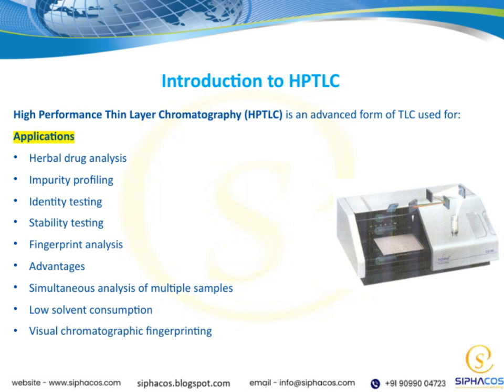Now, moving on to the advantages that HPTLC offers over traditional methods. One significant benefit is the ability to analyze multiple samples simultaneously, which saves time and increases efficiency. It also uses less solvent, making it a more environmentally friendly and cost-effective option.